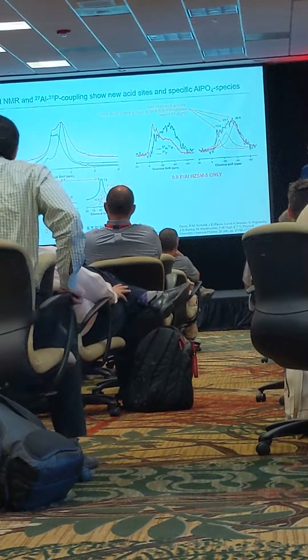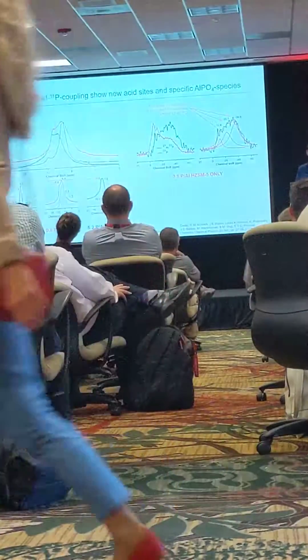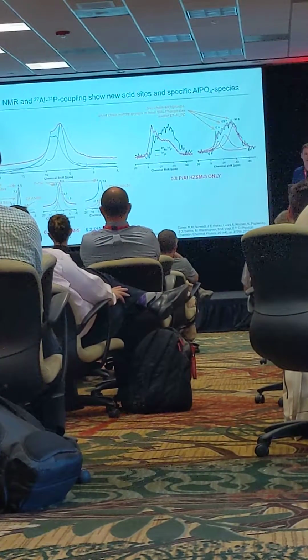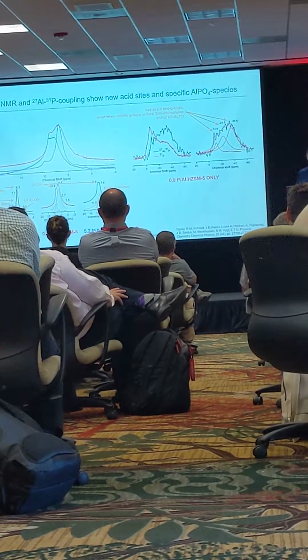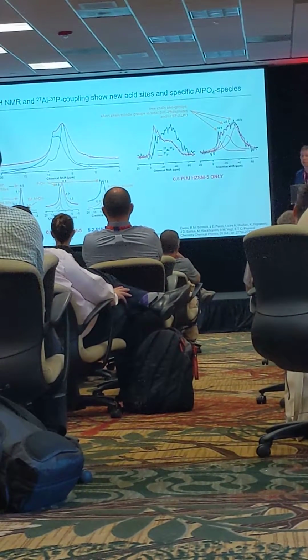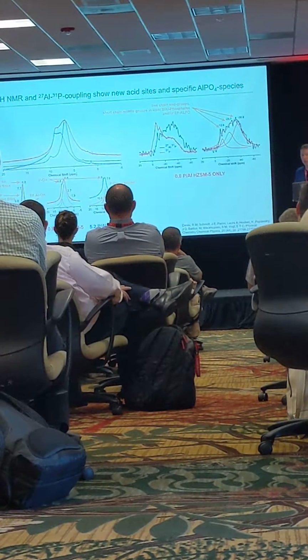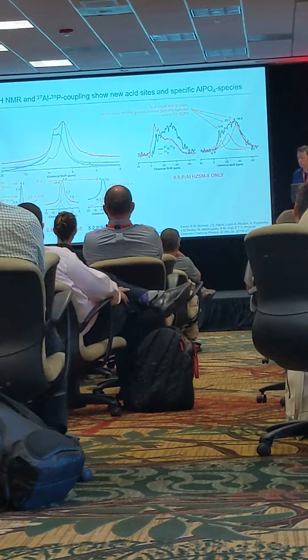And this is the most important one, really. There's peaks on both phosphated samples that are consistent with the formation of POH species. That's an entirely new acid site that's being formed in the ZSM-5 when it's phosphated, okay? And we'll talk some more about that and where it's located as I finish the next couple of slides.